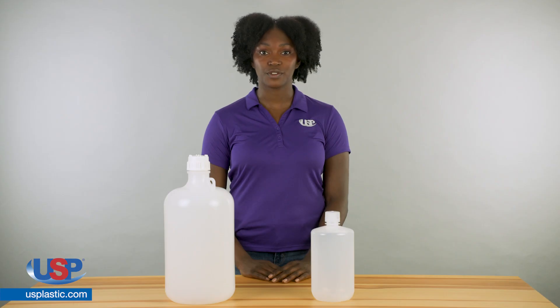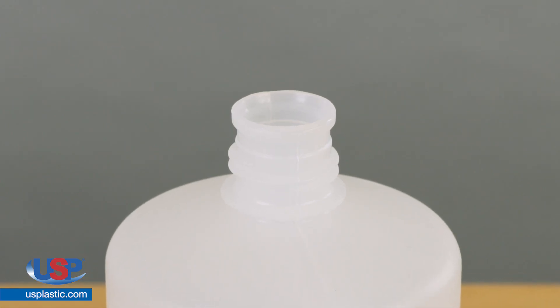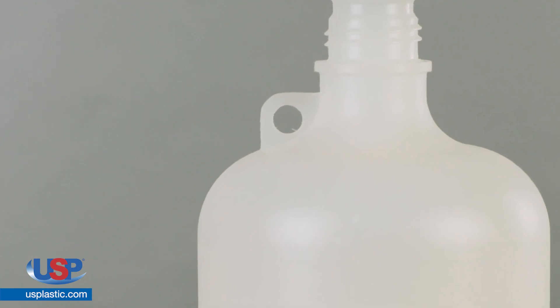These bottles are perfect for collecting and storing liquids. The narrow mouth of these bottles improves pouring. The 4 and 8 liter bottles have an integrated shoulder loop for attaching an ID tag.